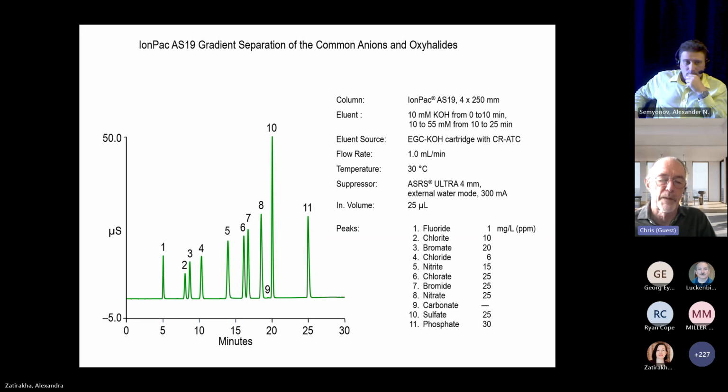So I started working on a strategy for making a hyperbranched phase, where you first make a linear polymer with a primary amine and this diepoxide, and then when you form it in the presence of resin, it makes a monolayer, but for every nitrogen, it's still a tertiary amine, so it will react with the epoxides again.